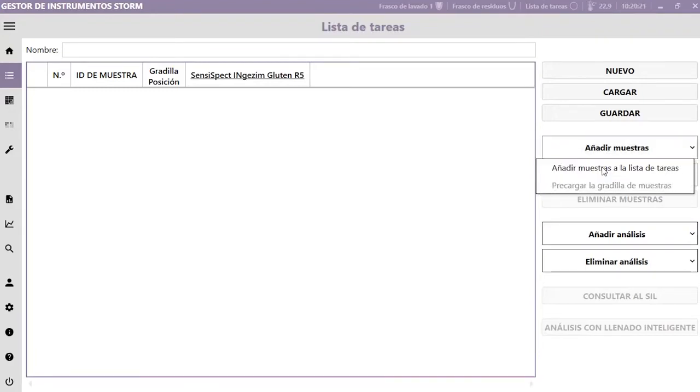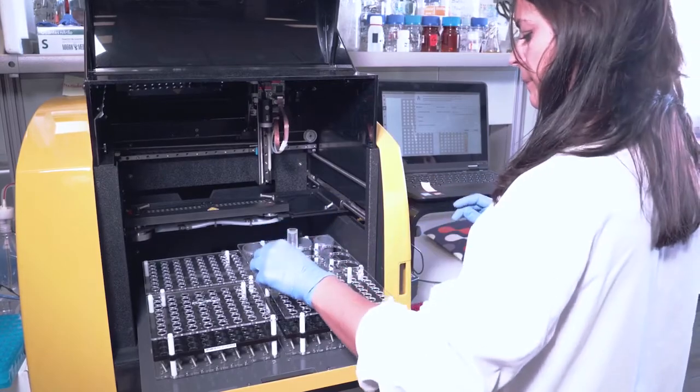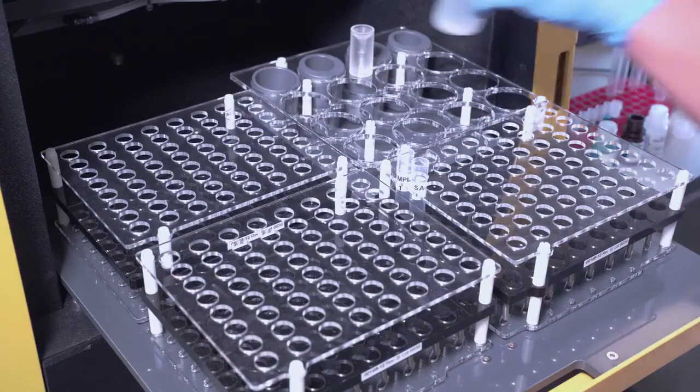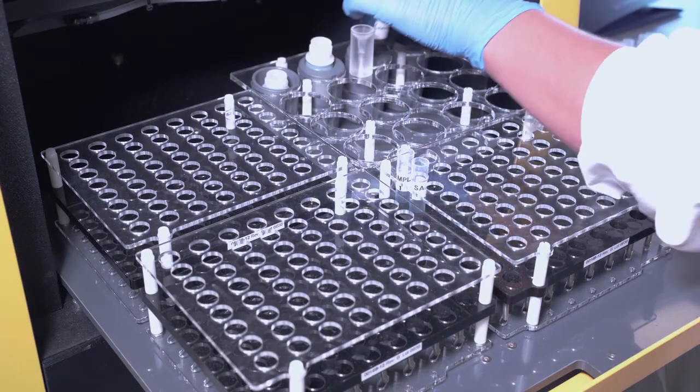Load the gluten program. Select the samples and the corresponding dilutions. Add the reagents and the calibration curve in the correct holes, following the program instructions.